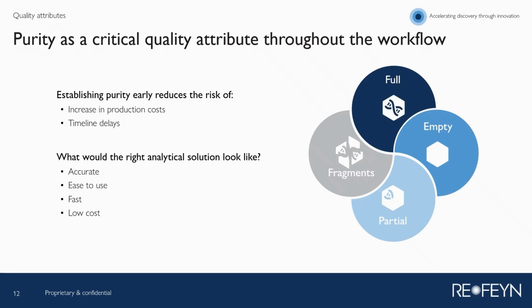This is why it's key to completely characterize your product at an early stage in the process, because this helps reduce the risk of increased cost for production and also delayed timelines where you're trying to rework your process and product in the downstream phase of the process.